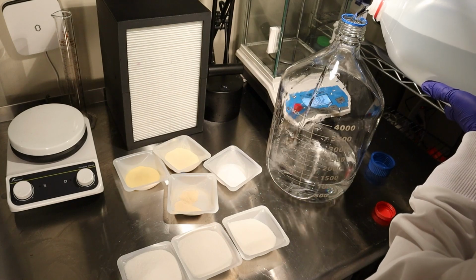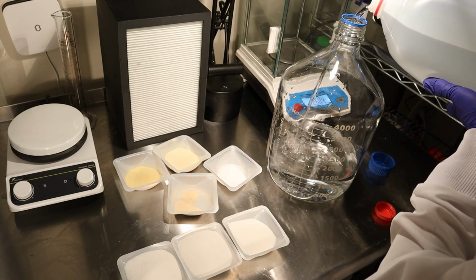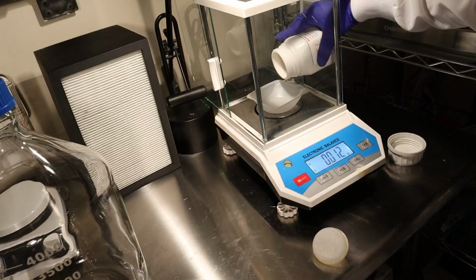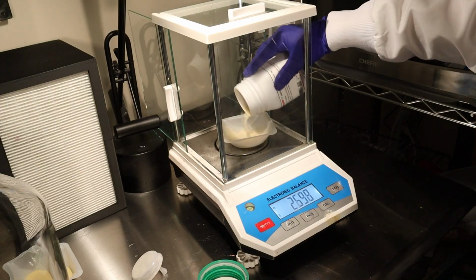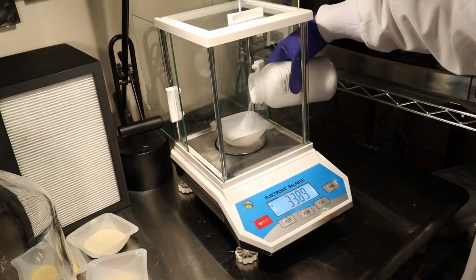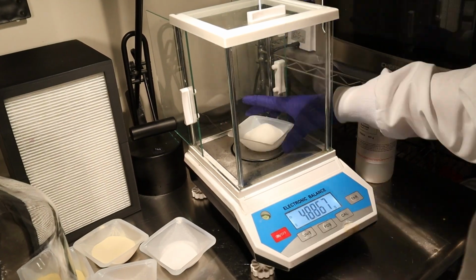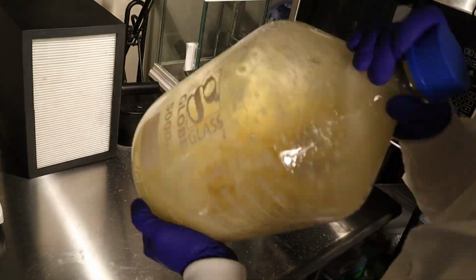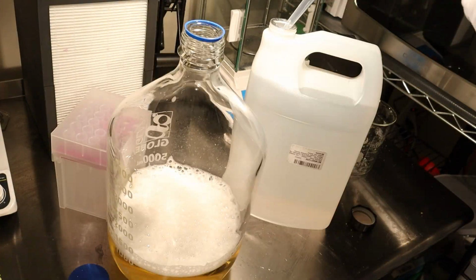Instead of 1.3 liters of water like I was supposed to, I added 1.5 liters of water to the bottle and weighed out 4.5 grams of yeast extract, 7.5 grams of peptone, 4.5 grams of malt extract, 15 grams of glucose, and then a whopping 255 grams of sucrose. Then I mixed everything together. I then added 500 ml to the baffle flask once it all dissolved.